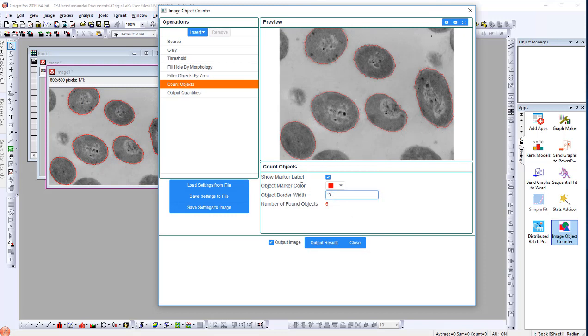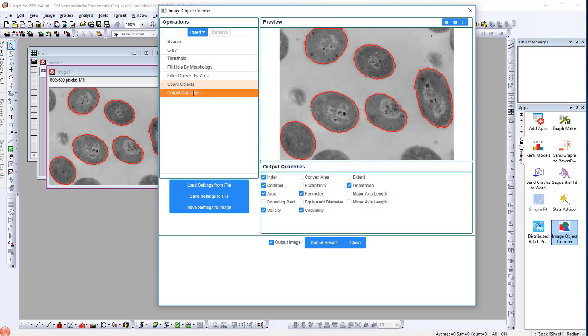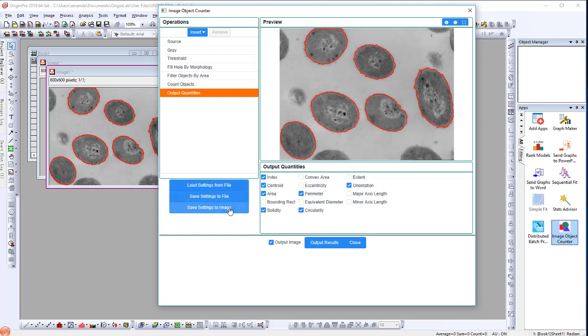Now, I can select Output Quantities to choose which quantities I would like to output. You can also save these settings for future use. For example, I will select Save Settings to Image.